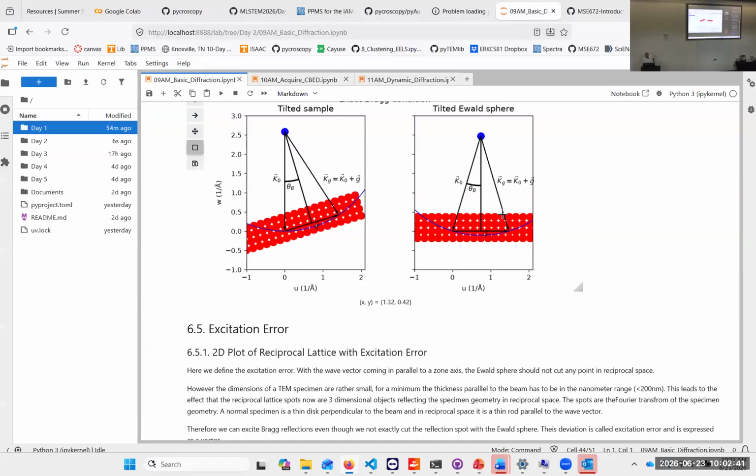G3G. Okay. You really don't care for the different Kikuchi lines. You will see that if you go to a G3G, so that's when I go to the third order of the Kikuchi lines and put them through the center in order to go in this case, weak beam condition. Probably you see actually when you tilt out that you will have the deficient and excess line very clearly separated in that case.